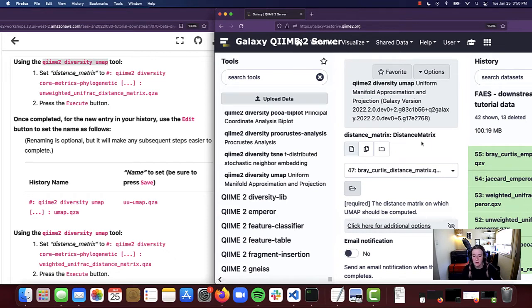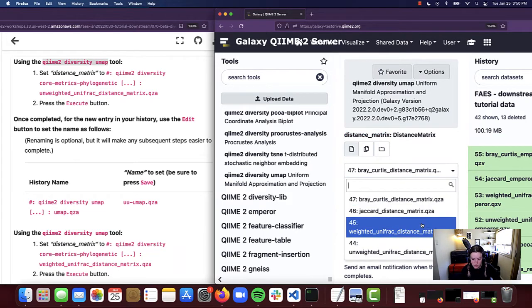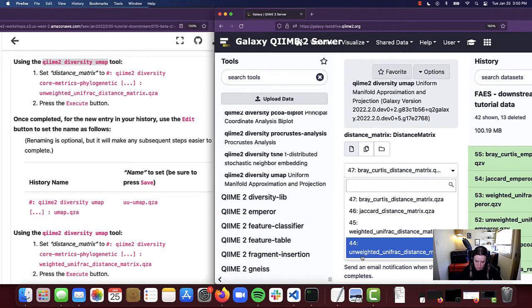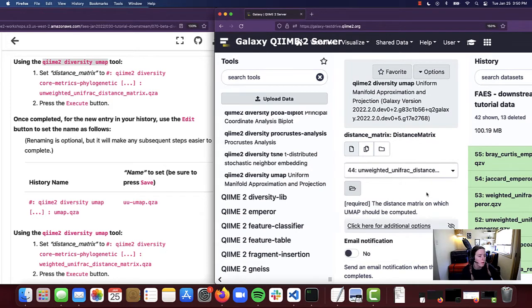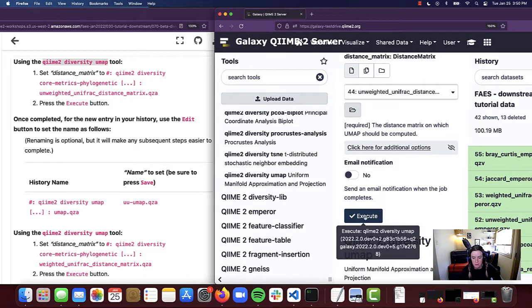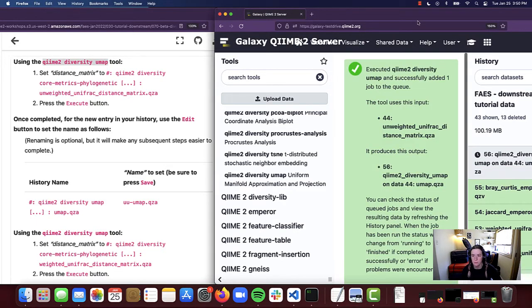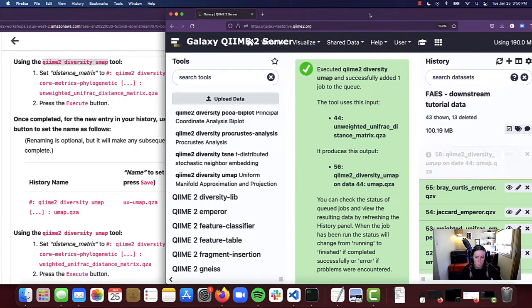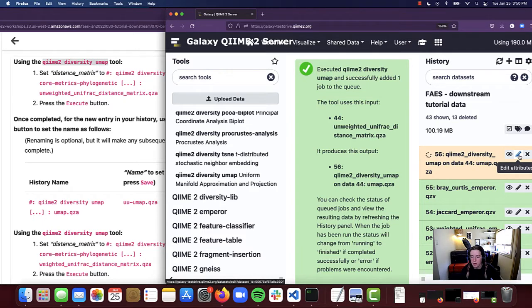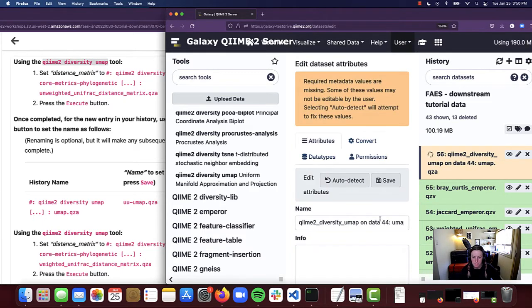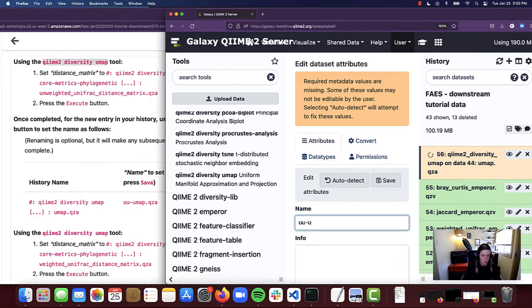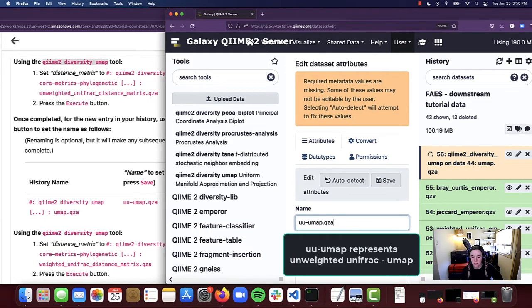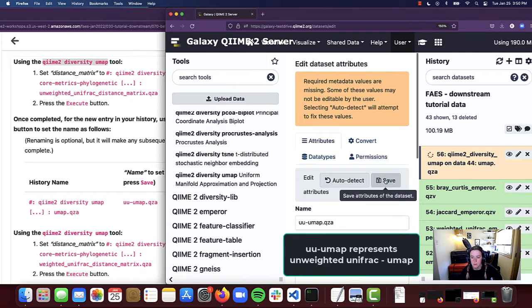I am going to select the unweighted UniFrac distance matrix.qza file under the distance matrix input, and then go ahead and select Execute. While we are waiting for that to complete, I'm going to click on the Edit Attributes button and rename this to UU-UMAP.qza, then click Save.